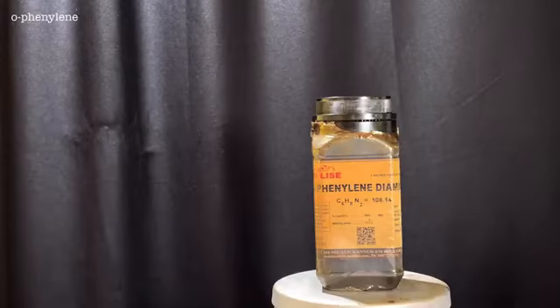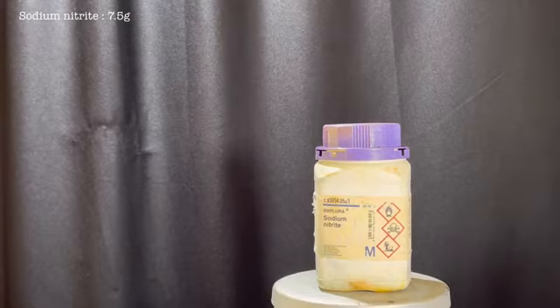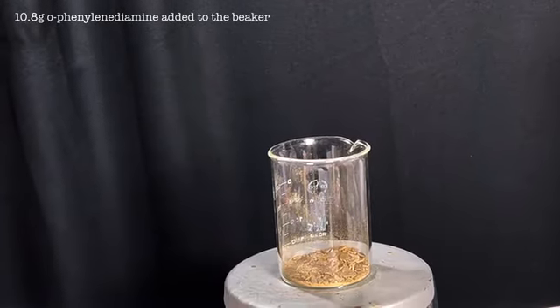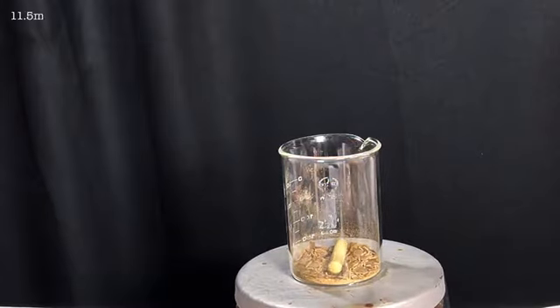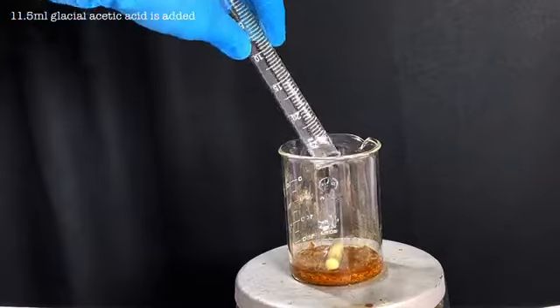properties. For this synthesis we will need 10.8 grams of orthophenylene-diamine, 11.5 milliliters of glacial acetic acid and 7.5 grams of sodium nitrite. Start by taking 10.8 grams of orthophenylene-diamine in a 250 milliliter beaker. Place a magnetic stirring bar and add 11.5 milliliters of glacial acetic acid to it.